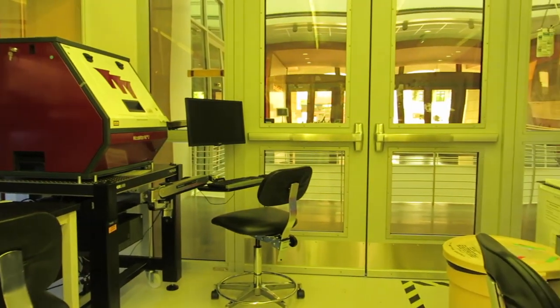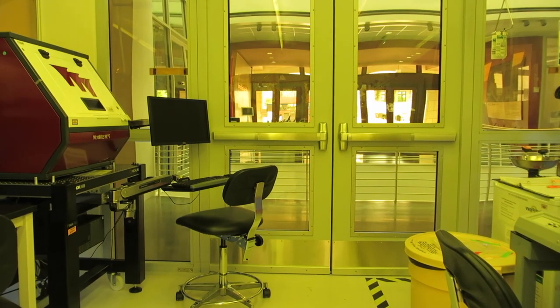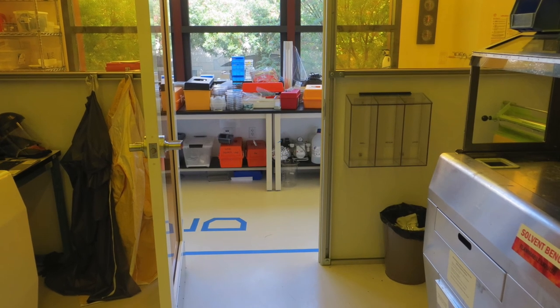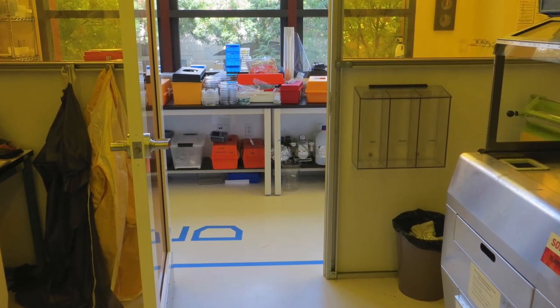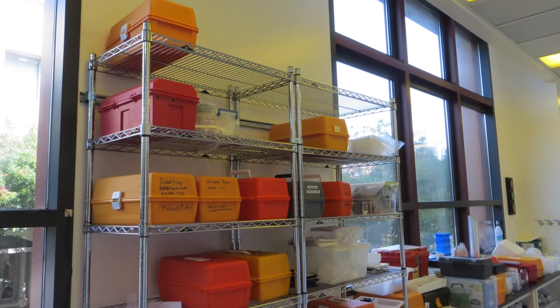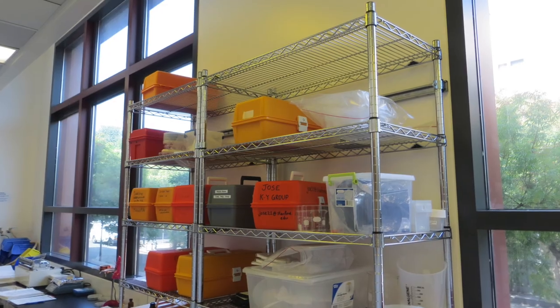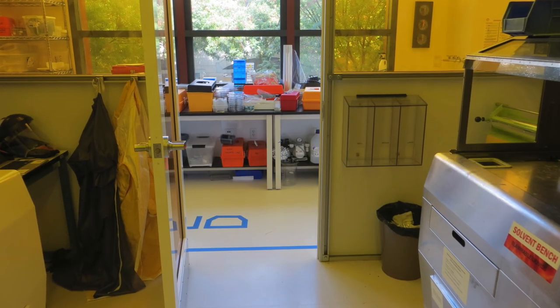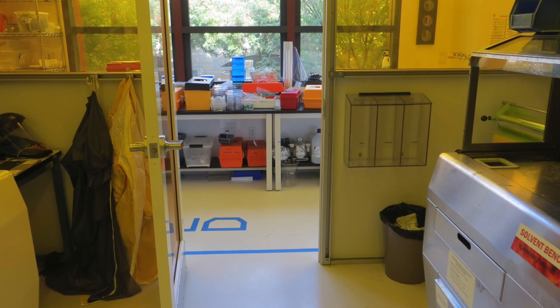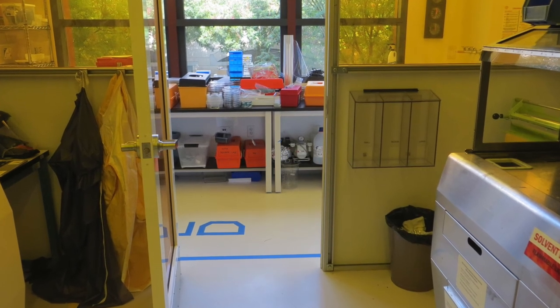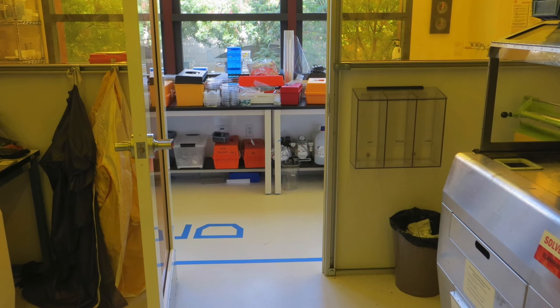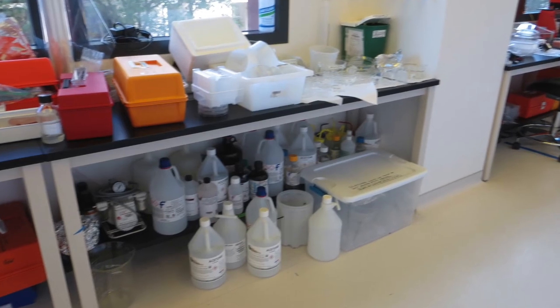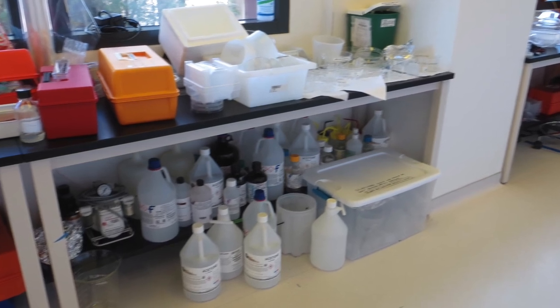These doors as well as any of the other doors in the lab that go out to the hallway can be considered emergency exits. Before leaving the yellow room make sure you have left the countertops clean and dry. Put away any of your belongings in a plastic toolbox with your name on it. Don't leave anything on the counter when you are done. If you need to let something soak in an etchant or in solvent, be sure to leave a note stating your name, what's in the beaker, the dangers of it, and when you'll be returning.